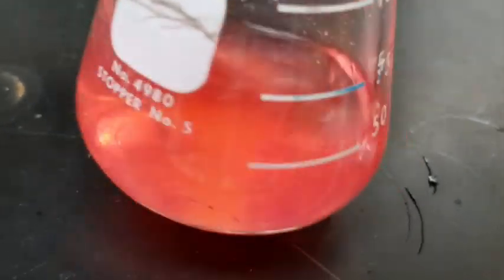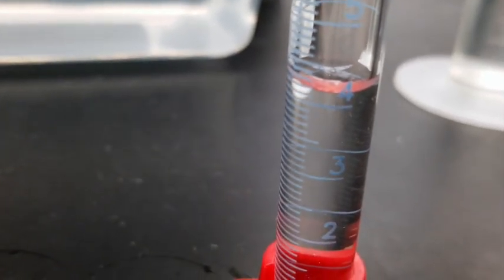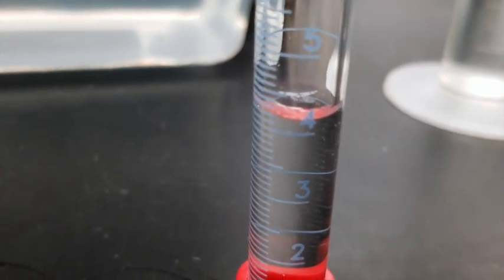Continue adding the drops until the color just changes from red to yellow. If you have any solution remaining in the pipette, put it back into the 10 milliliter graduated cylinder. Record the remaining volume of sodium hydroxide in table one as final volume. Complete the table and start your calculations.